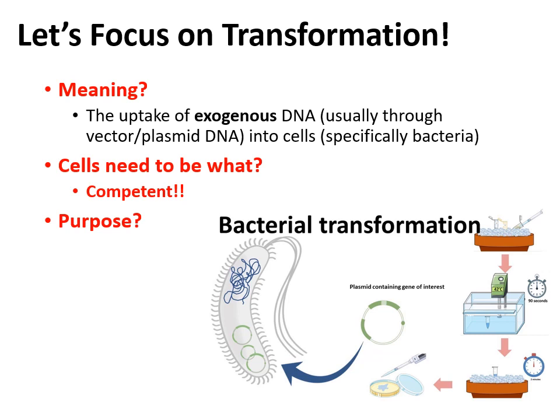They're going to make tons and tons of copies of that new gene, or those new genes if there's multiple of them, and they will then ultimately produce the proteins that those genes code for. So now you have these nice little factories capable of making tons of whatever gene, whatever protein, meaning valuable enzymes, you want lots of copies of. For instance, in the medical field, this was one of the first ways that they got a lot of insulin produced. So it's a very valuable technique.